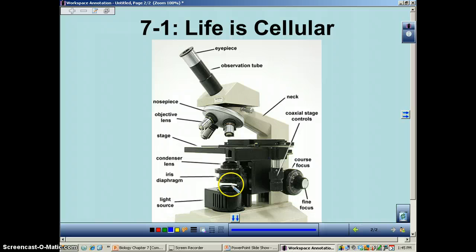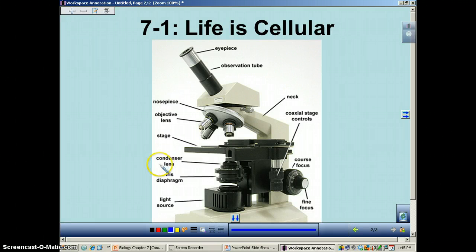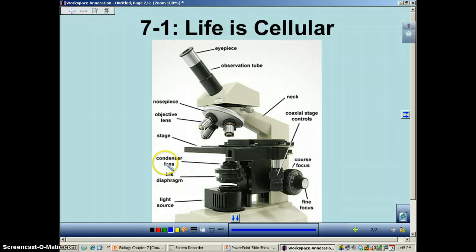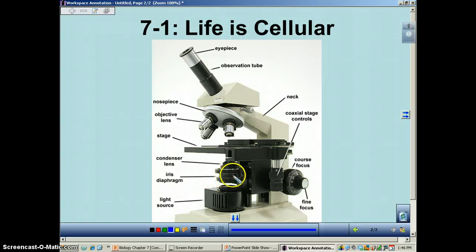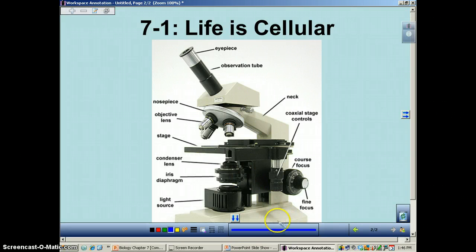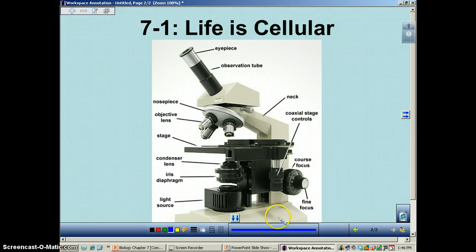This is your light source. These lenses right in here are going to control how much light goes up into the object. The condenser is essentially going to condense the light — in other words, make it tighter — so the light can get through this little hole right here. The diaphragm will control basically how much light goes in. In our microscopes at school, we also have a light intensity control — think of it like a dimmer switch at your house.